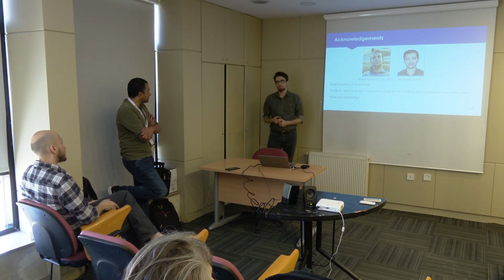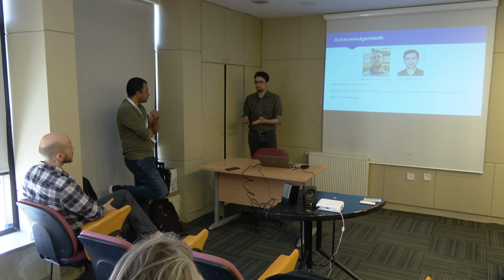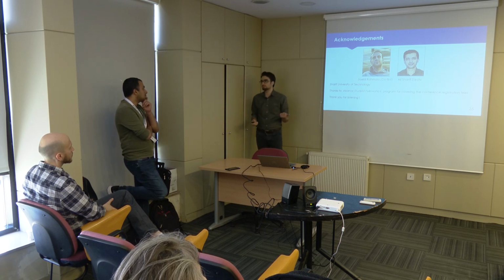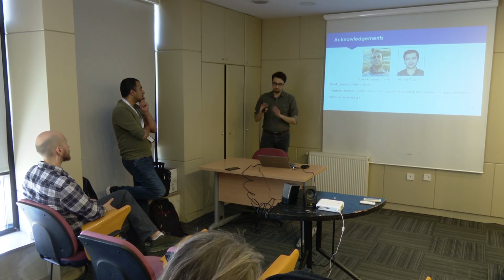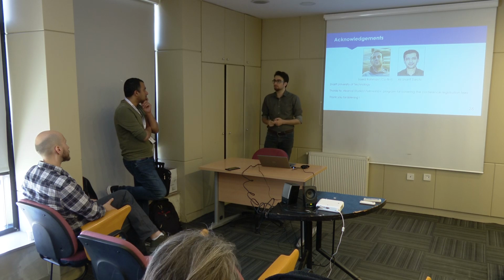Well, I think it might help. I'm not actually sure how the ComBat method aggregates the reference genes. I assume it is also using the mean of them, just taking the average. I think this may also help to reduce the technical variability and biological variability of the reference genes, and maybe this optimization is applicable there too in RNA-seq.